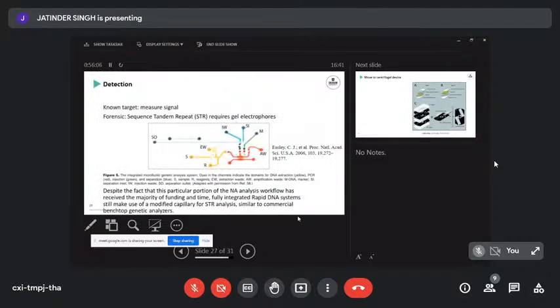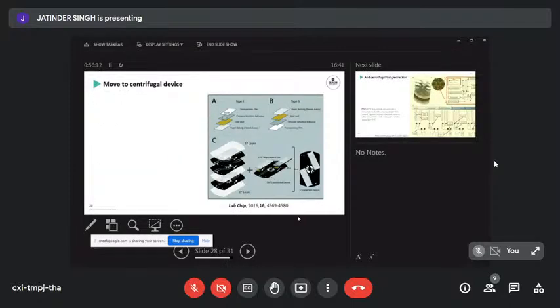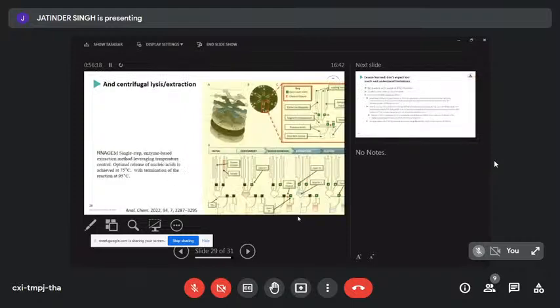Technically, these are exactly the same separation conditions as they used here. What they've won is, A, integrated electrodes, and B, fluidic control sorted by a spinning disc, which then interfaces with the other thing that I've done.